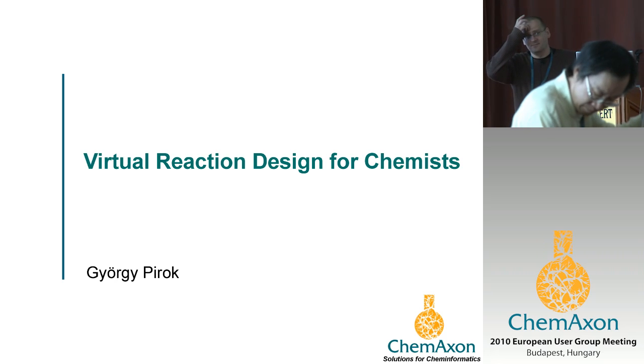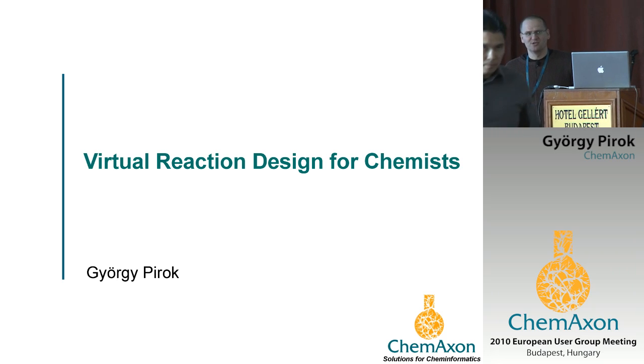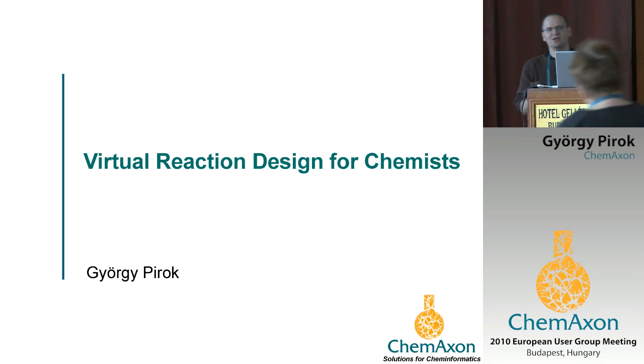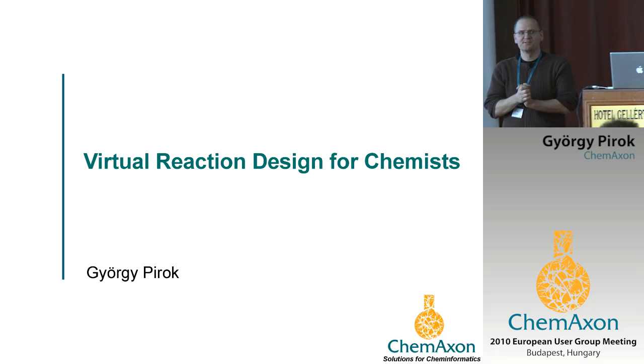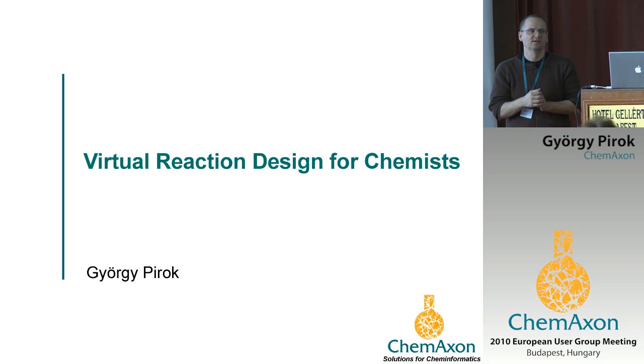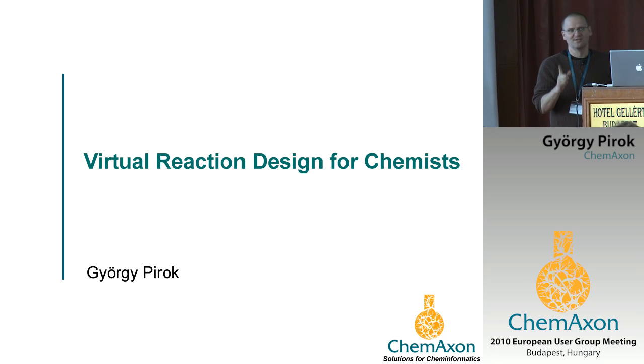So welcome everyone. It's so good to see so many people here at this UGM, more and more every year, and I'm happy to see many familiar faces. So actually, I would start with a question, because there are many familiar faces. I suppose that many of you have seen Reactor running. Who hasn't seen a Reactor application demonstration before? 1, 2, 3. Not too many, so I will be very short, but will not ignore it completely.